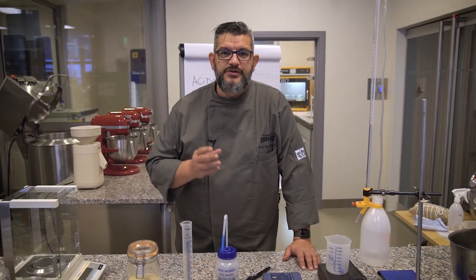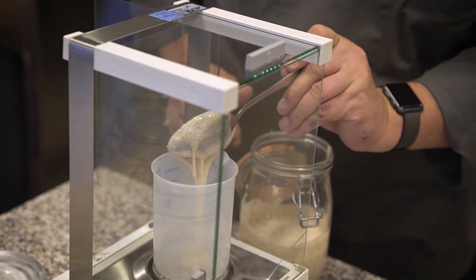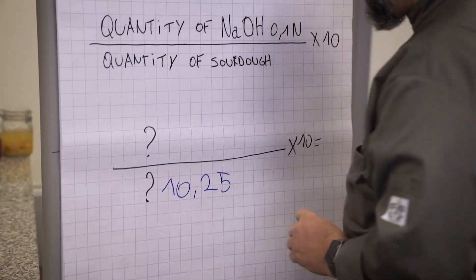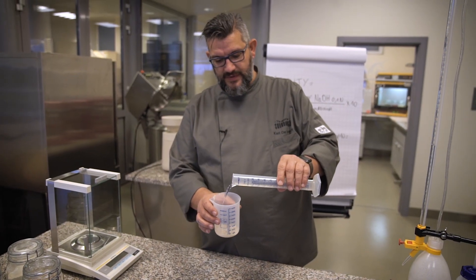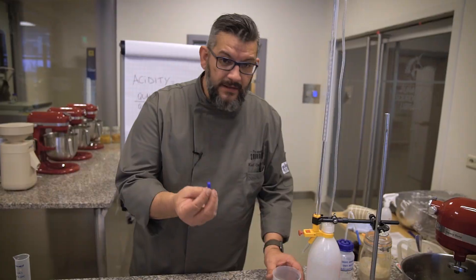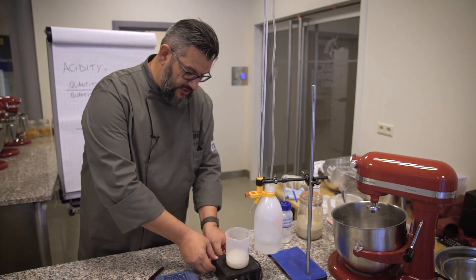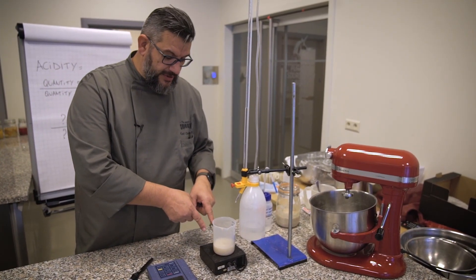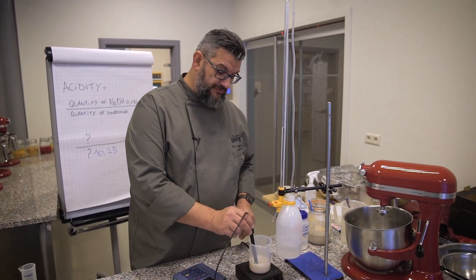The first thing we need to do is to weigh 10 grams of sourdough. We have 10.25 grams of sourdough. We need 100 milliliters of water. We add this into the beaker and now starts the fun. The magnetic stirrer will dilute the sourdough into the water. What we need to do now is to start measuring the pH of this solution.